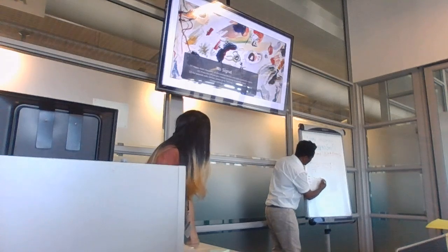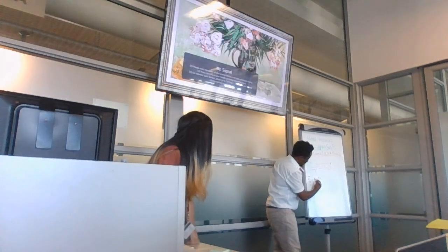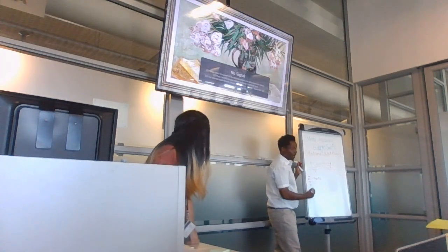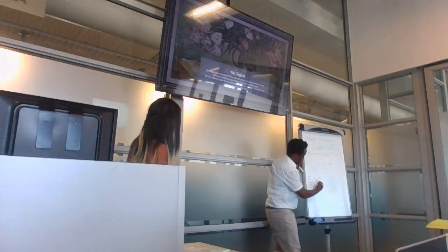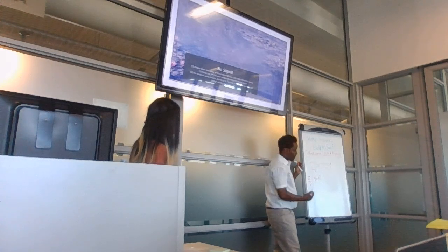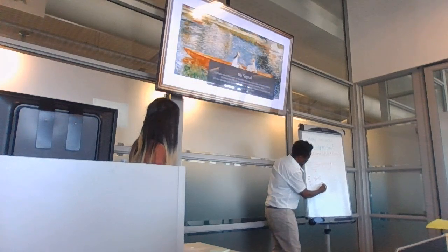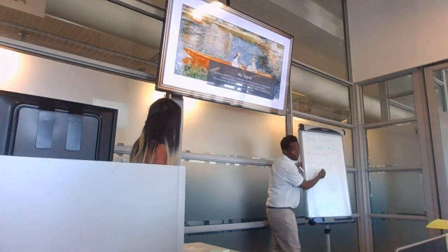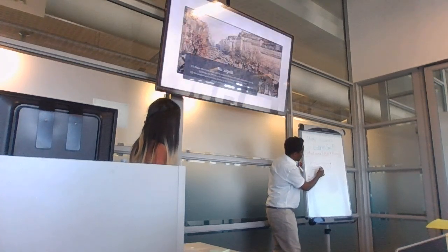The way we do it is we sequence in this direction and in this direction. So this is your reverse read, and this is your forward read. Note that there's a region in the middle that sometimes doesn't overlap. But remember that we're doing this multiple times, and these fragments overlap. So in another read, we sequence this region, which overlaps with the previous one.